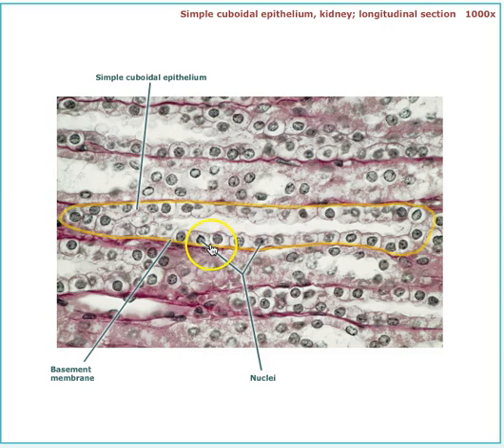More of the simple cuboidal. And also, here highlighted in yellow, there's the simple cuboidal. And then here, this thin layer of cells surrounding it, you have some simple squamous. You have the basement membrane shown here, and the nuclei shown here. And you also see that the nucleus is taking up the majority of the cell. You have a nice round nucleus, whereas with the squamous you saw a flat cell with a flat nucleus.